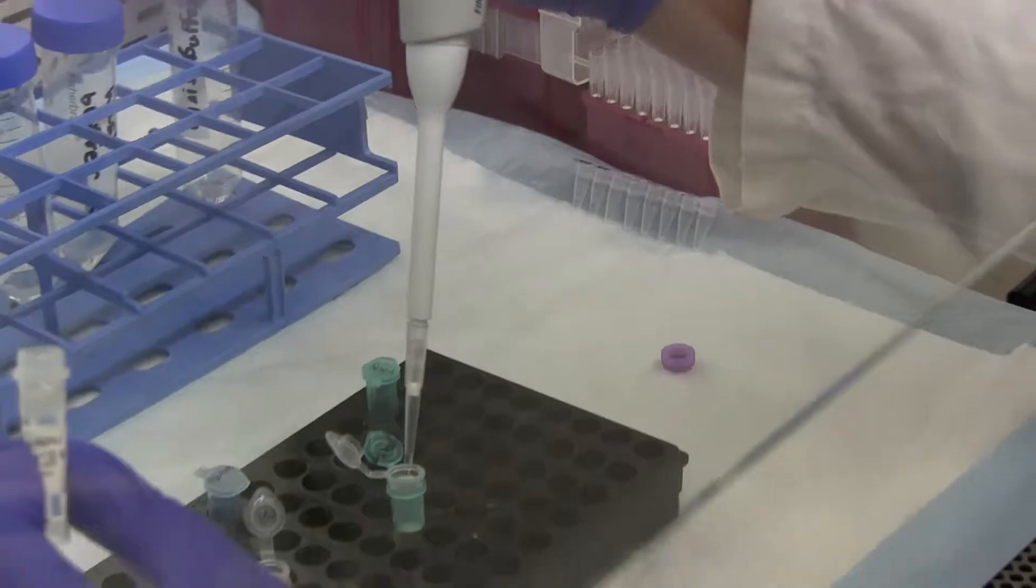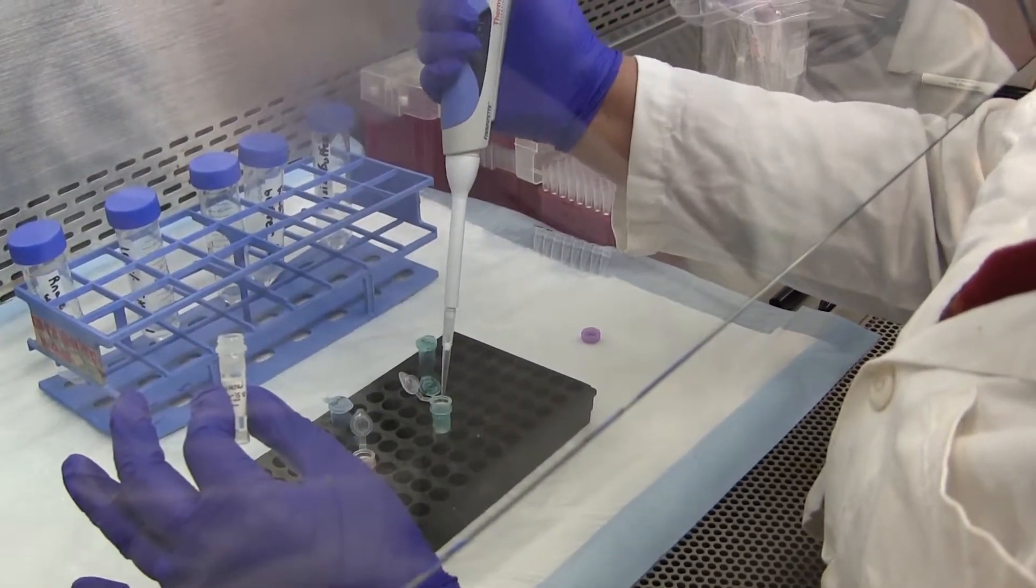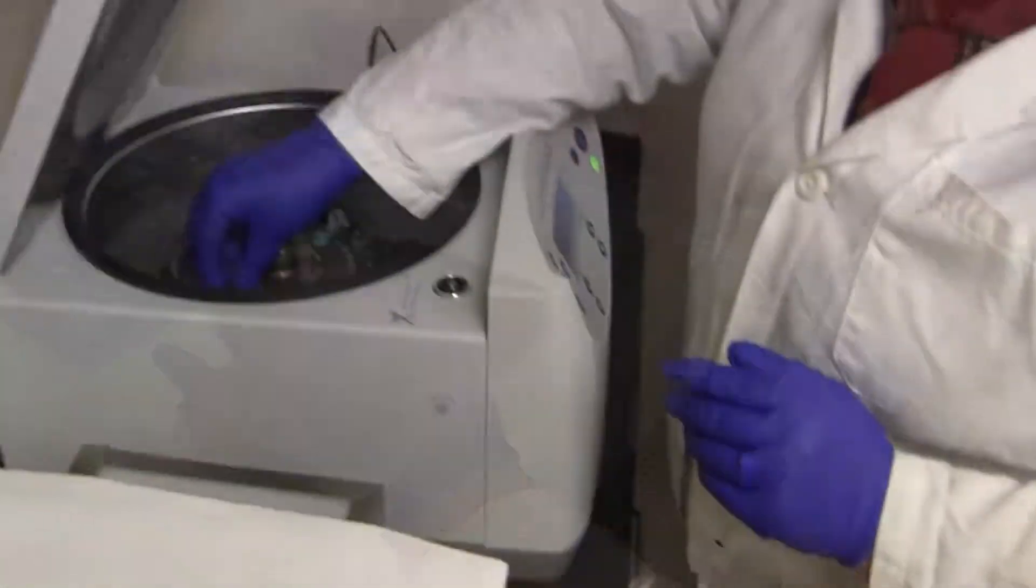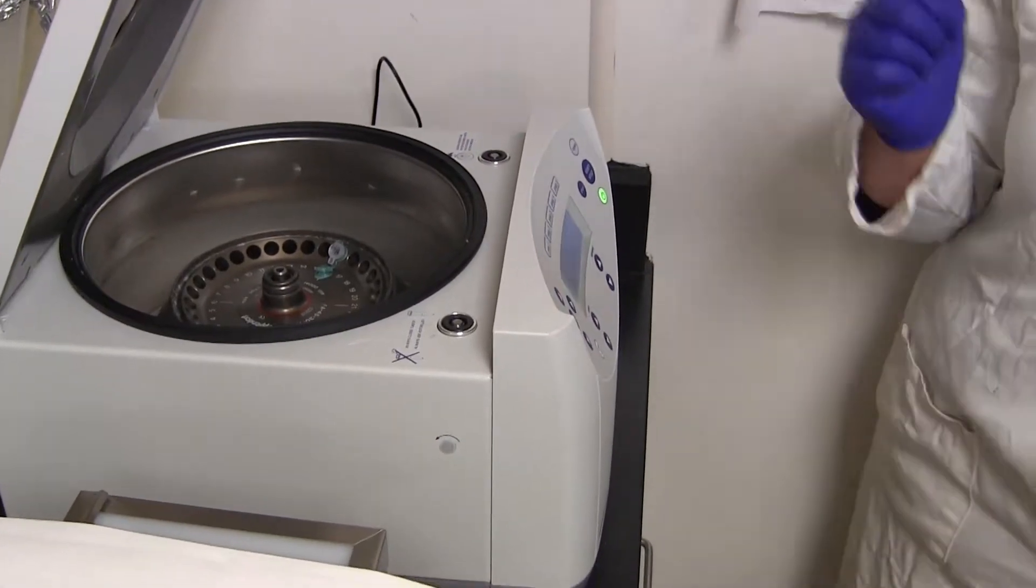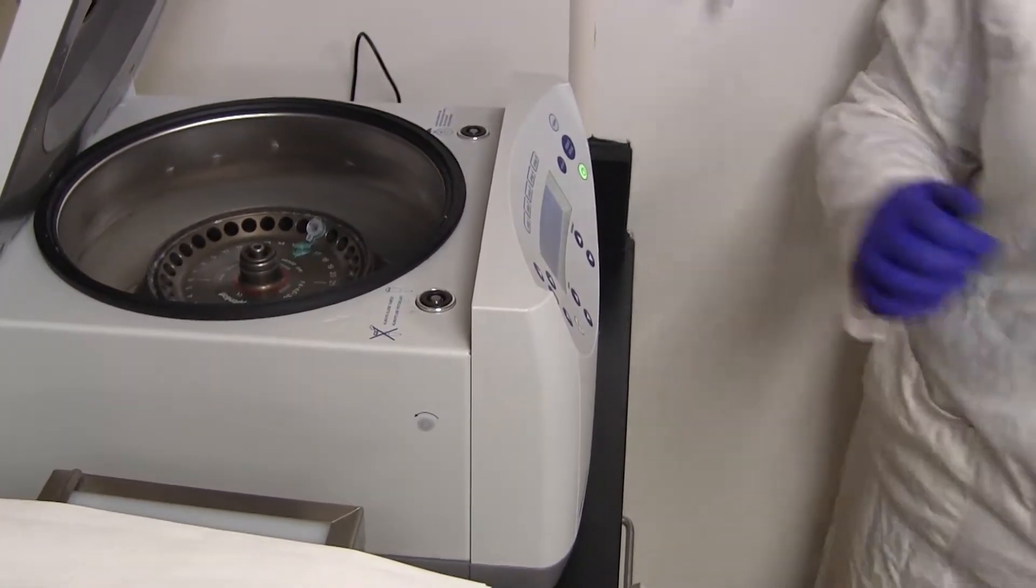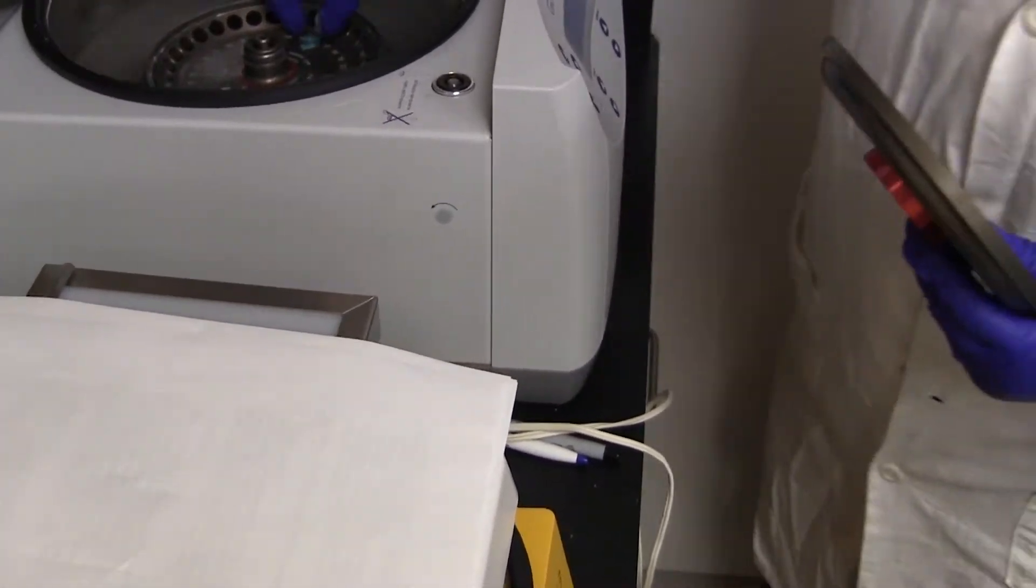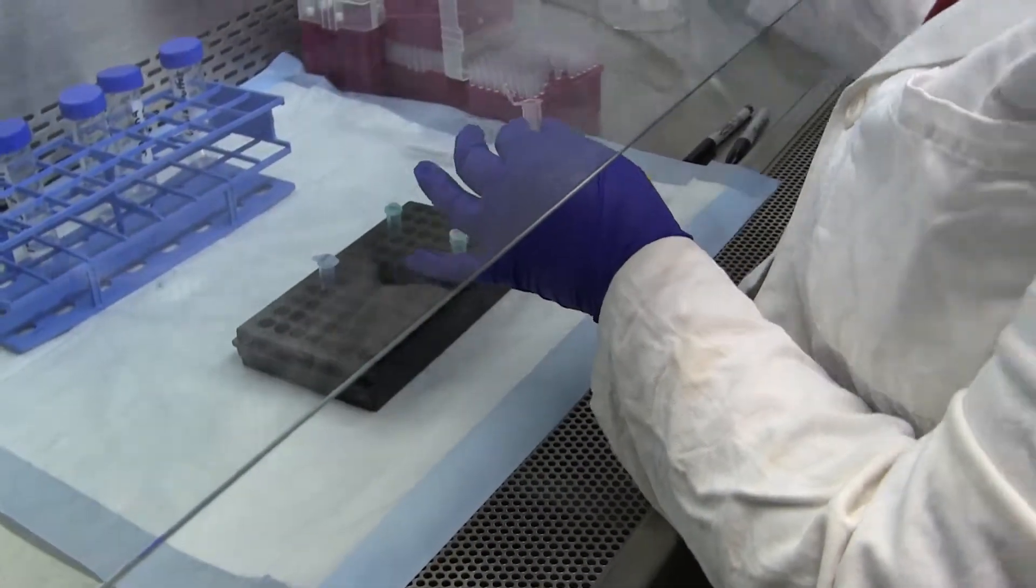And careful again, you don't want to touch the column when you add it. And so then we're going to let it sit for one minute. And so you see the tubes are put into the centrifuge with the caps pointing inwards, so that will allow you to still be able to close the centrifuge lid.